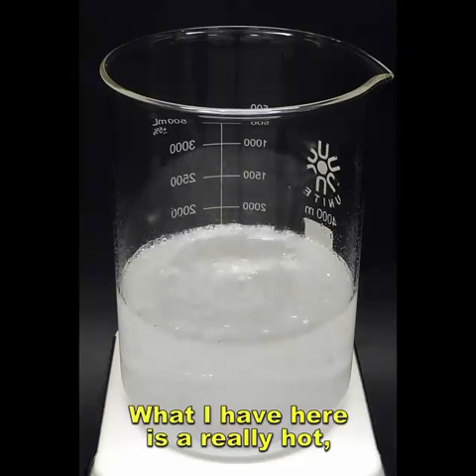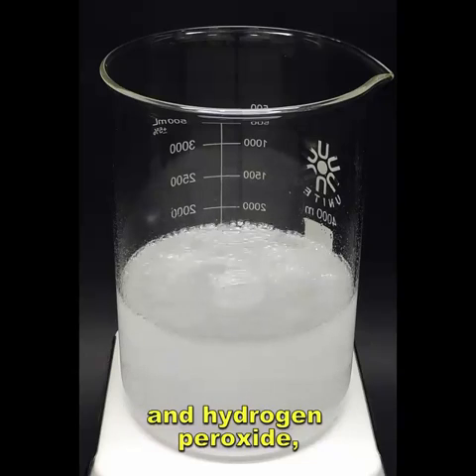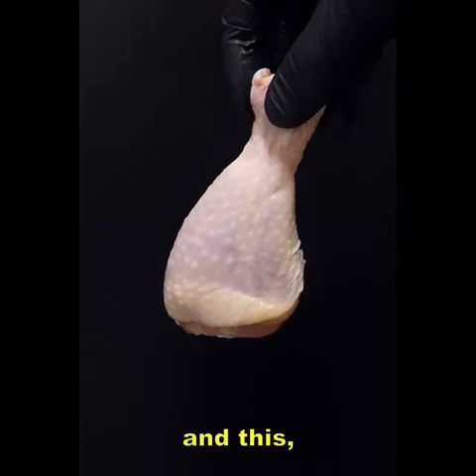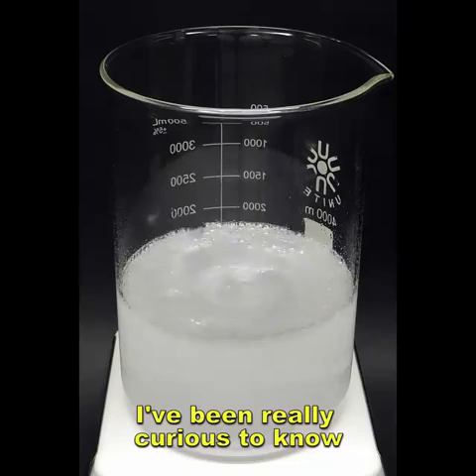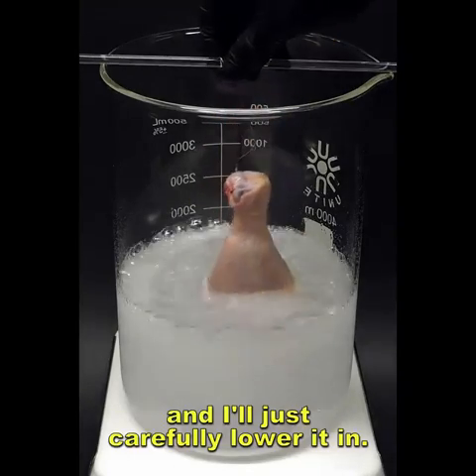What I have here is a really hot and scary mixture of sulfuric acid and hydrogen peroxide, also known as piranha solution, and this is just a regular chicken drumstick. I've been really curious to know what it would do to a piece of chicken, and I'll just carefully lower it in.